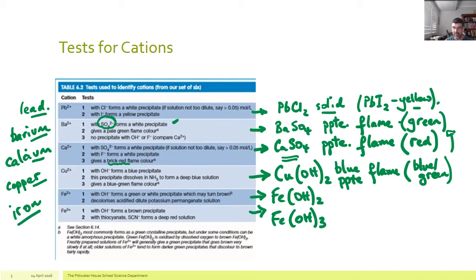The reason we're looking at these is because while they both form precipitates, the Fe2+ ion forms a green or sometimes a white precipitate, which may ultimately turn brown as it changes from Fe2+ to Fe3+, but the Fe3+ one is already a brown. So when we first form these, we get a clear difference between each of these two.